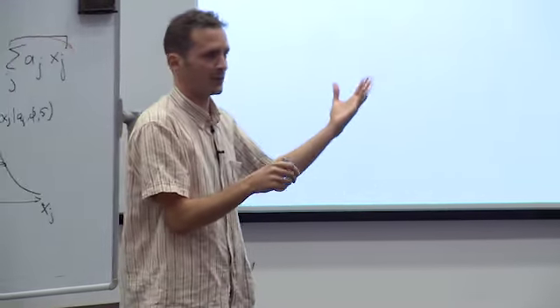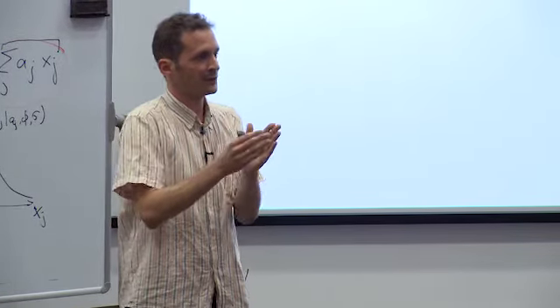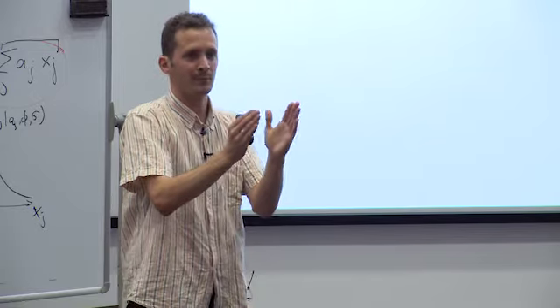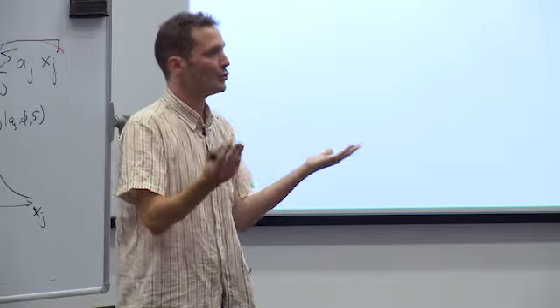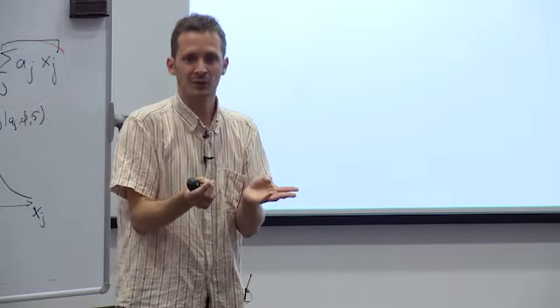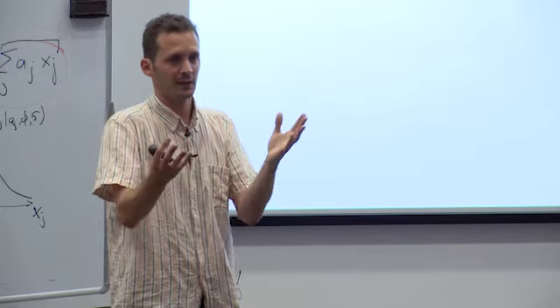The way we do that inside this whole maximum likelihood framework, but you could do the same in the maximum cross-correlation framework, is to expand this array of missing parameters, which was just the in-plane orientation before, with a new hidden parameter, which is now the classification parameter. So we're going to start with a given number of classes that the user has to decide on, and we're going to divide initially the data set into that many random subsets.